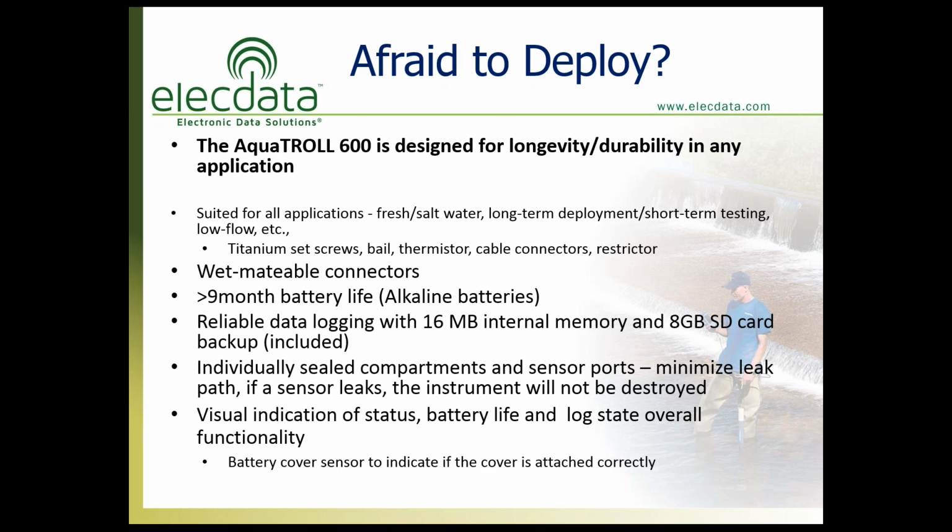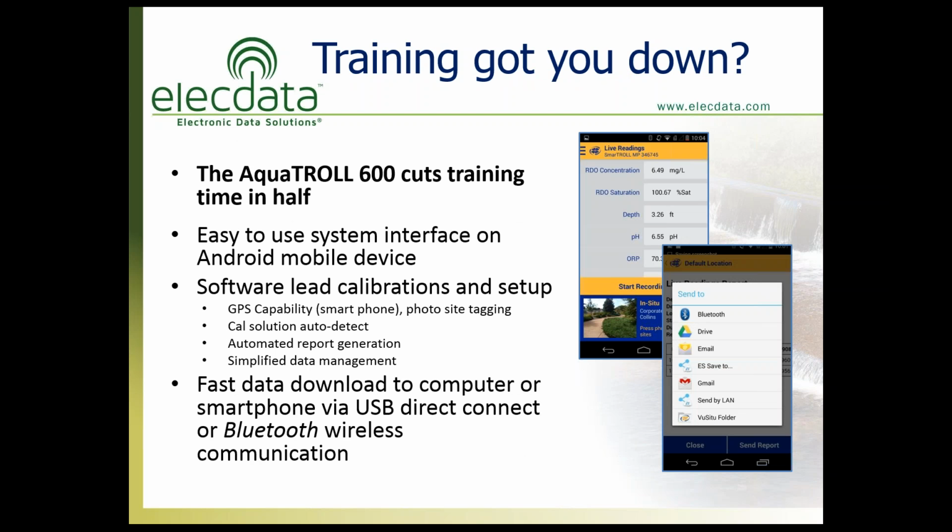They've even taken this to the point where the battery cover has a sensor inside of it to indicate if the cover is attached correctly. It's kind of interesting to see. So if you're snapping new batteries in there, that LCD will actually tell you that the battery cover is open or not in place, which is pretty cool.